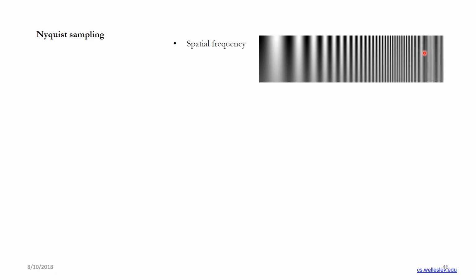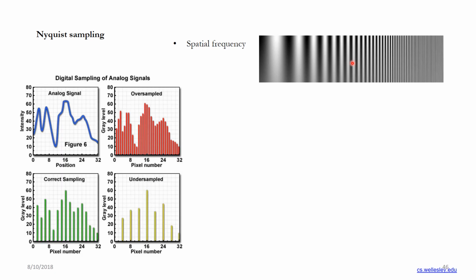If you see, this is more like a frequency, right? Whenever we think about frequency, we only think about radio, FM and things like that, right? But if you see here, spatial frequency, these bright and dark spots can also be like a frequency, right? If these are really far away, then this is a low frequency, this is a high frequency area. So if we try to sample that, and if we draw a line profile here, we are going to get an analog signal like this.